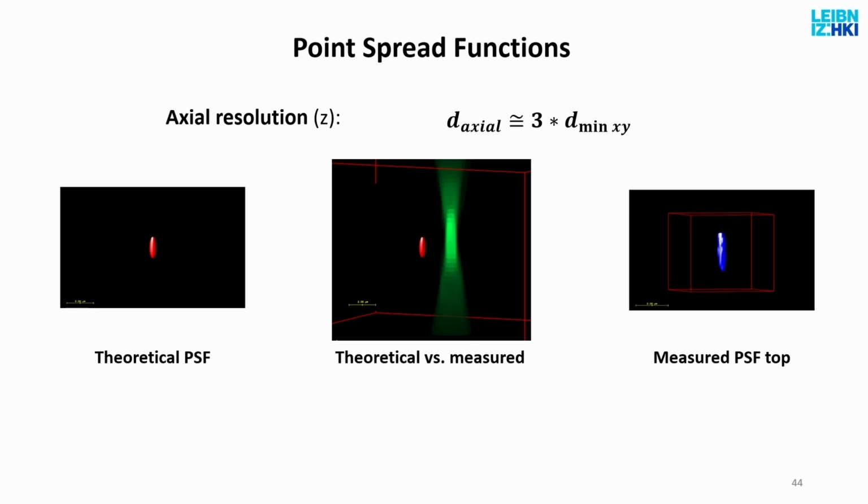Should I measure it? You should, because oftentimes the measured one is much bigger than the theoretical. So if I just use the theoretical one for what we will talk about next, I will underestimate the effect of the microscope. The problem is you cannot always measure. You are measuring the whole liver, and there's no way you can put little beads inside the liver cell.